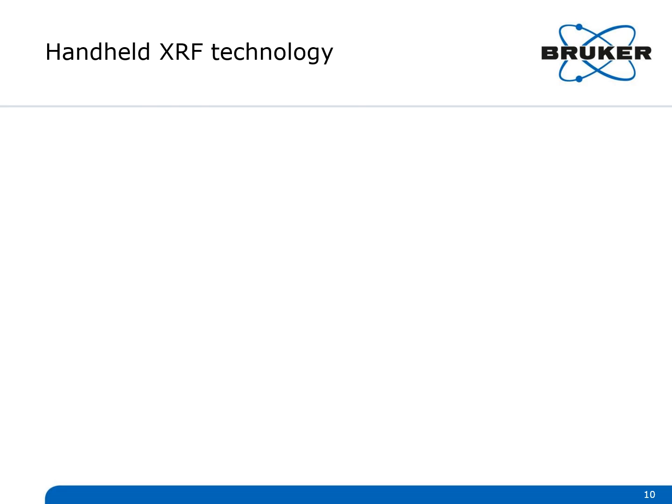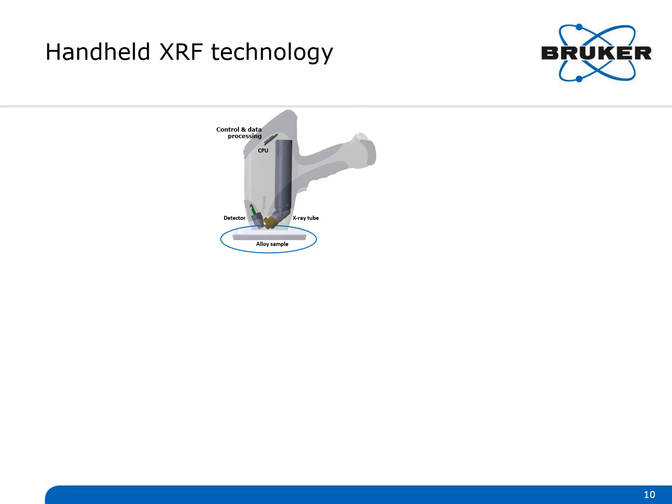How does the handheld XRF see elements? Well, it has an X-ray tube which irradiates energy to excite elements in the sample. It also has a detector to see which elements were excited and are therefore in the sample. The handheld XRF also has computing capabilities on board, which not only control it, but process the data collected, which then give you answers in the form of an alloy ID.